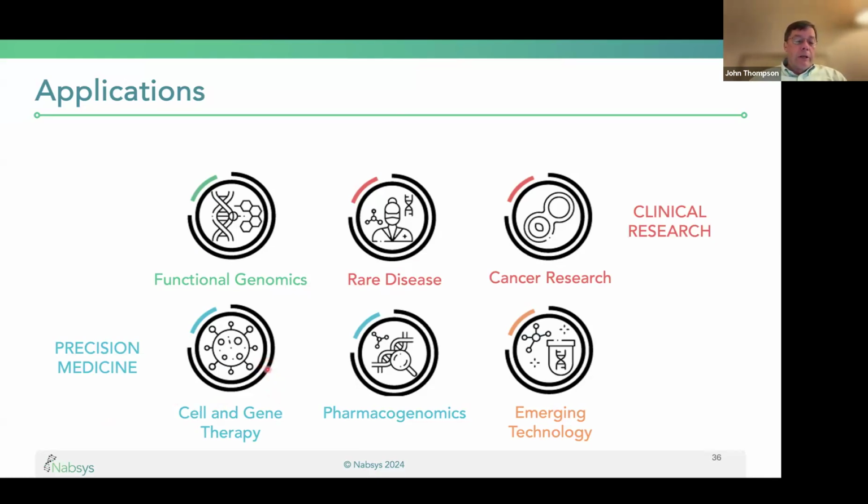Are you maintaining the same genome structure as you expand pluripotent stem cells? Pharmacogenomics: I showed the 2D6, 2D7 insertion, but there are certainly many others, and the CYP enzymes tend to be susceptible to quite a few rearrangements, duplications, triplications. So having a mapping, a visual of how things work, is important in that area as well.